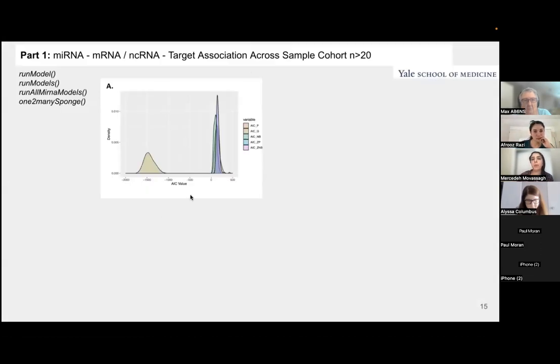And so this was what I was talking to you about when I was saying you use various models. In this particular case, we're using RPKMs and TPMs. So it's not going to fit well with distributions like Poisson and negative binomial, which are for count data. You can see that the Gaussian model in here is performing way better. So what I'm going to show you is with the Gaussian model. If you're putting in count data, most likely the other ones are going to be very helpful and are going to work better.